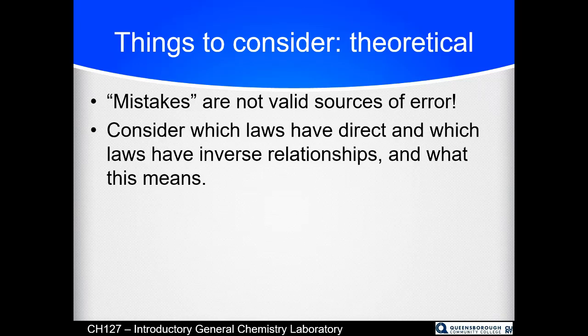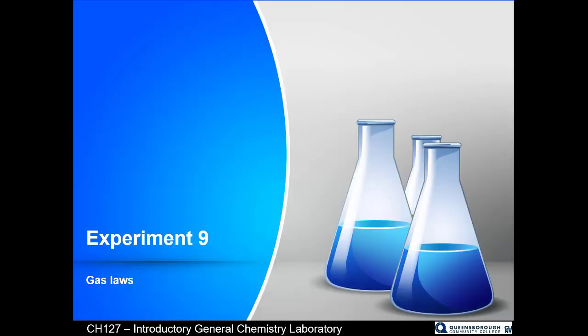As always, mistakes are not valid sources of error, and think about which laws have a direct relationship and which laws have an inverse relationship, and what that means for part 1 of the experiment and part 2 of the experiment. I hope you enjoy it.